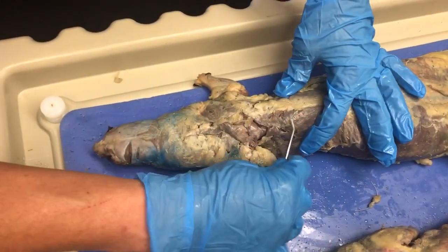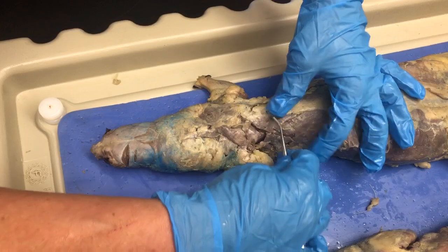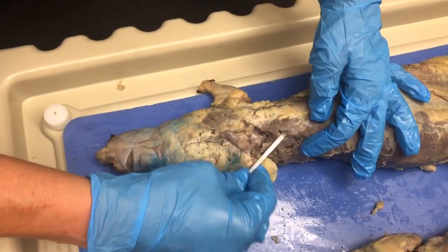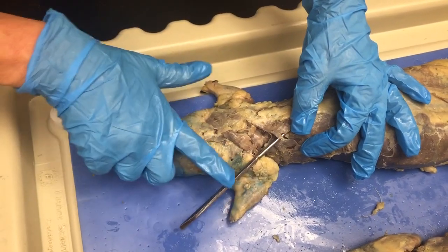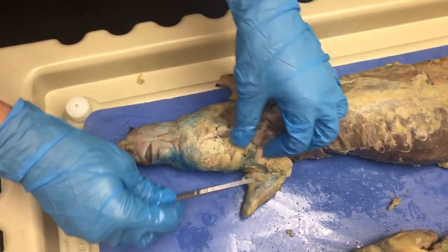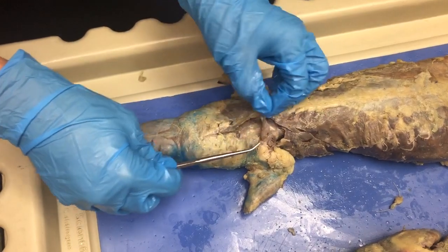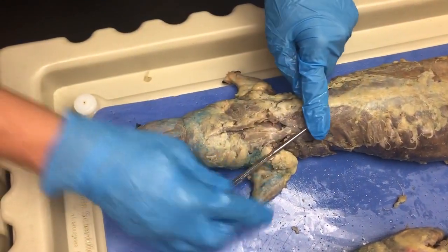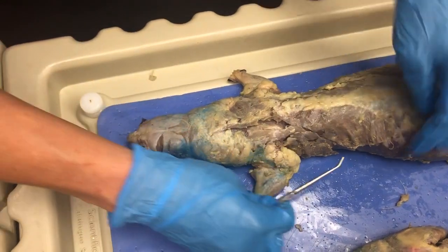So you can see this muscle right here. That's part of the trapezius muscle. There's one, and this is part of the second one. And on the neck. So that makes up all of the trapezius. That's a long one.